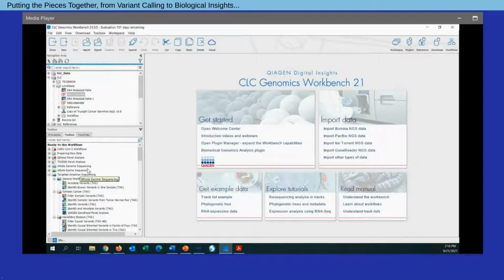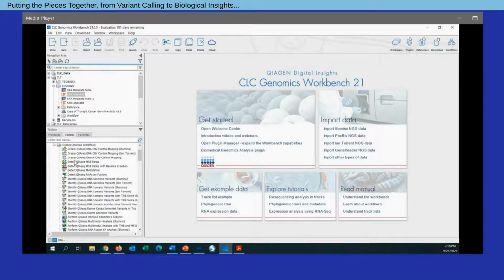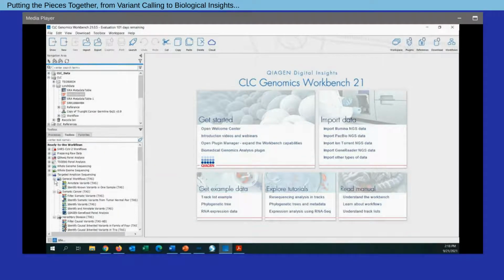Now, in this context, when we talk about variant detection, tied to Dan's talk earlier, we do actually offer pre-built optimized workflows for the various QIAseq panels that are offered through Qiagen. And in addition to that, we offer various workflows in place for whole genome sequencing and exome sequencing. And again, in the context of what I'm doing today, we have a targeted panel that we're going to look at for identifying germline variants.